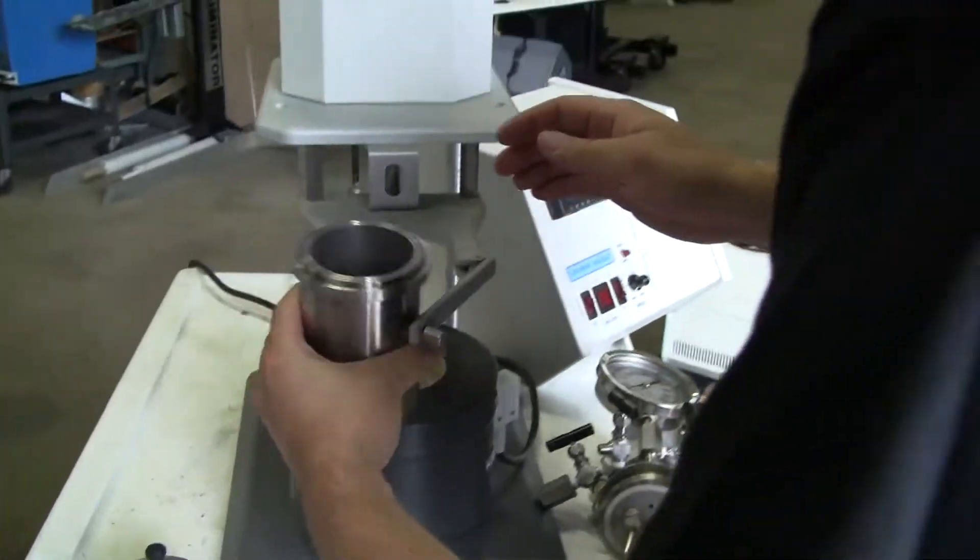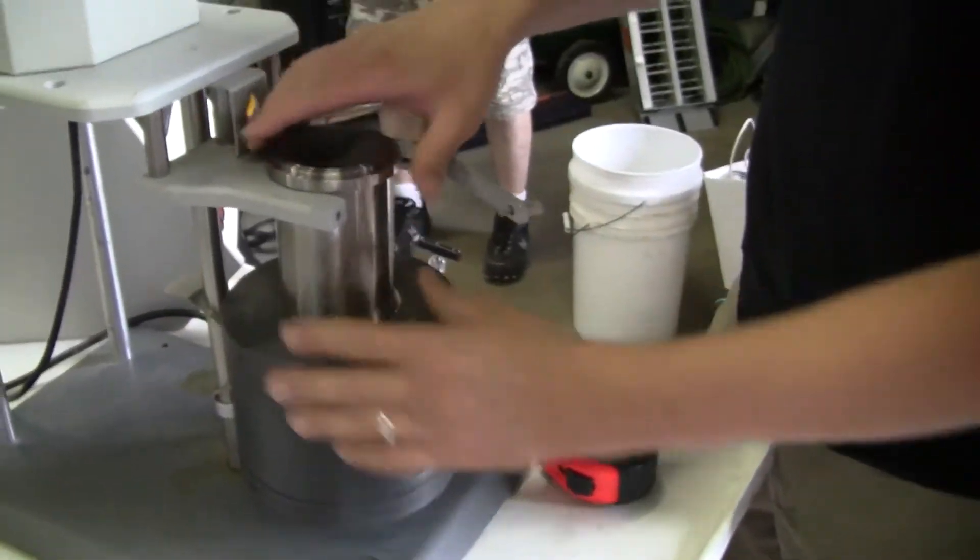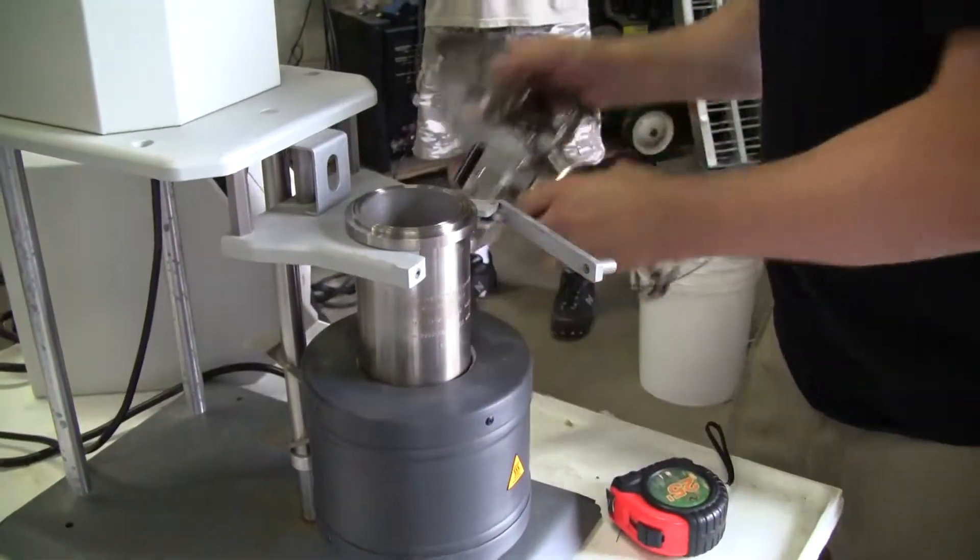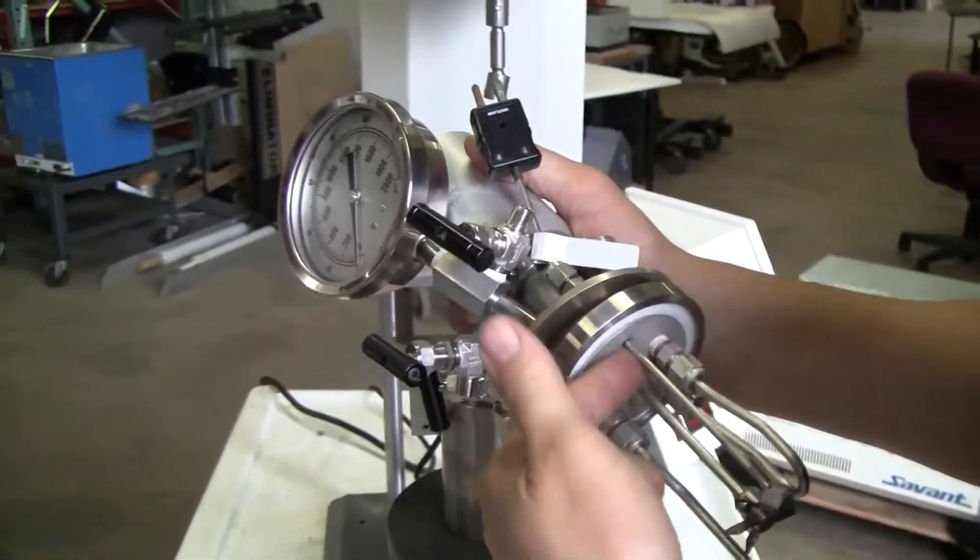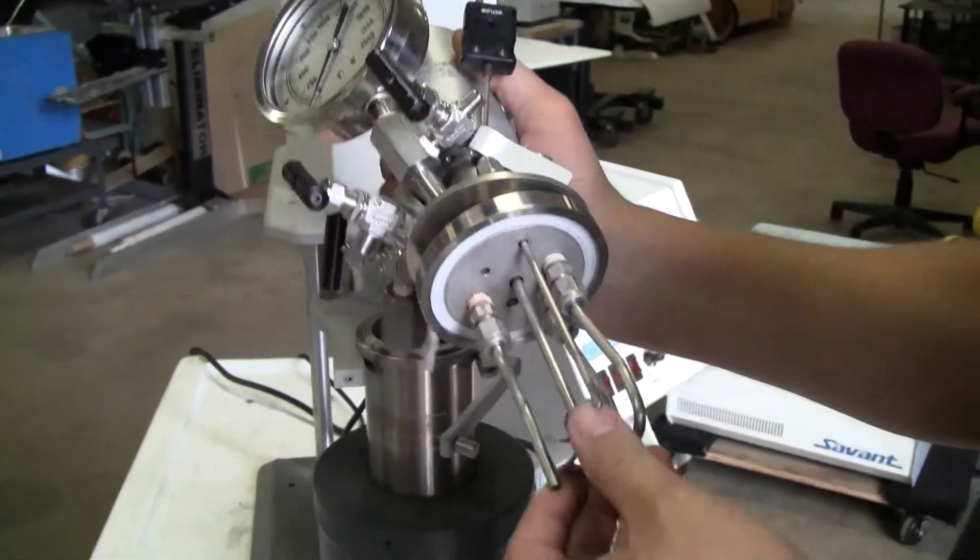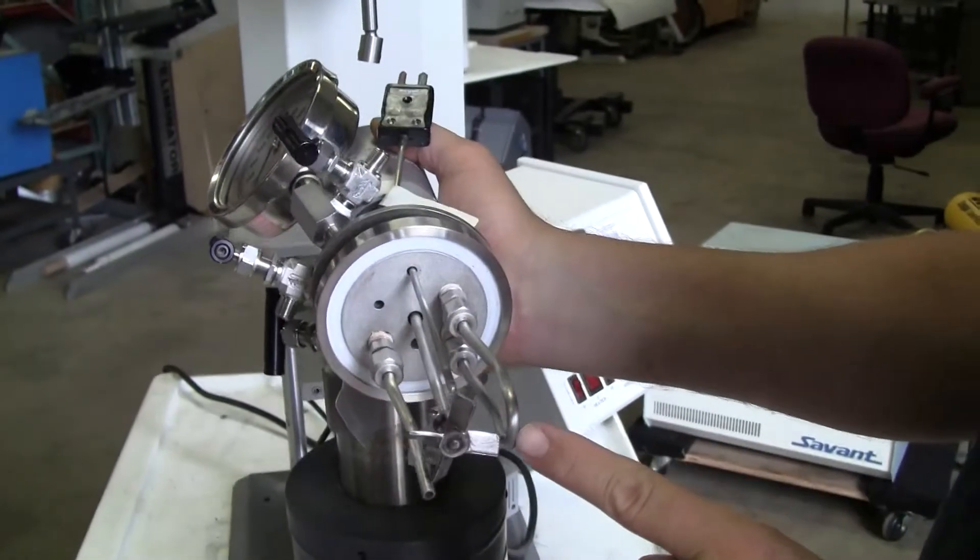The reactor fits in its little shell. Here's the reactor top. This is the thermocouple going into the thermocouple well. Impeller, gas, heat exchanger.